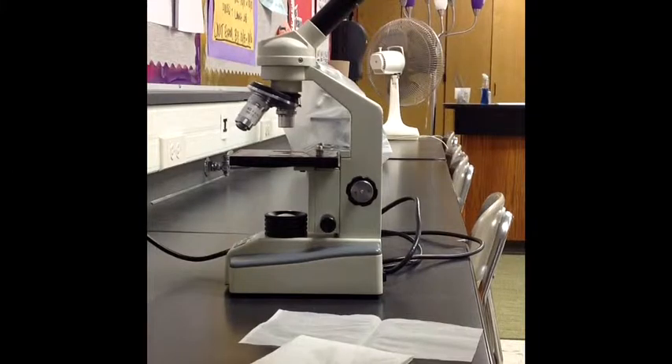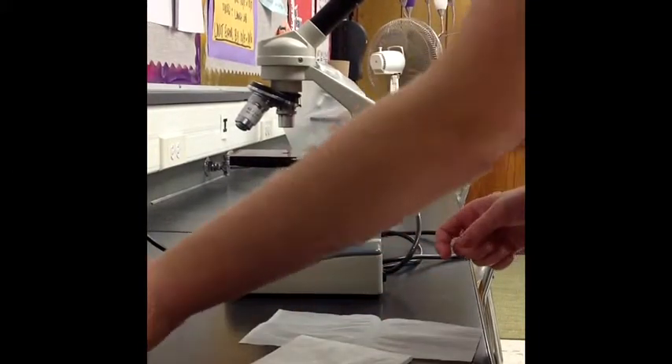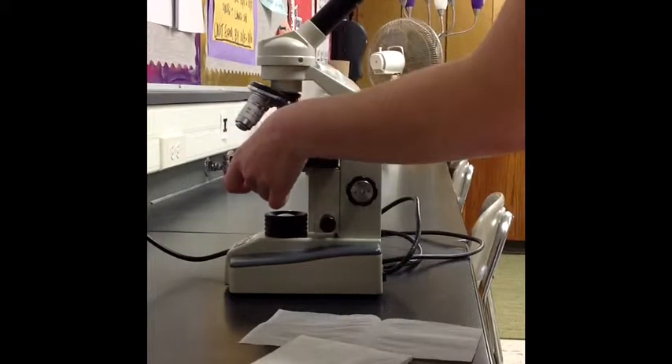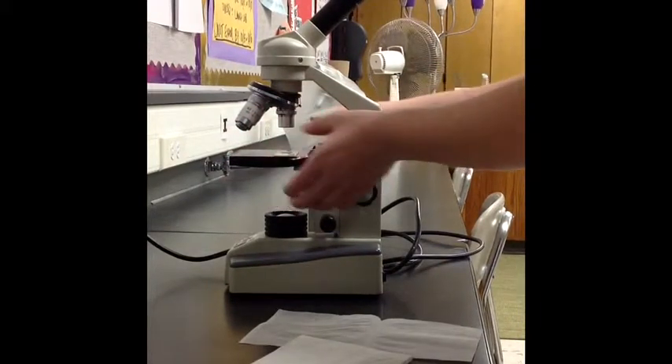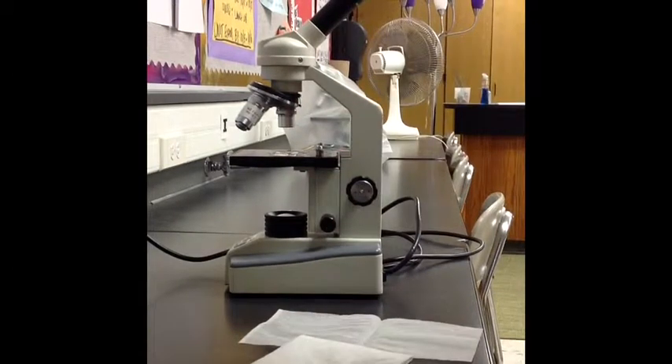Then move the stage clip so you can place the slide carefully onto the stage. Place the stage clips on the side to hold it down. Now turn on the microscope.